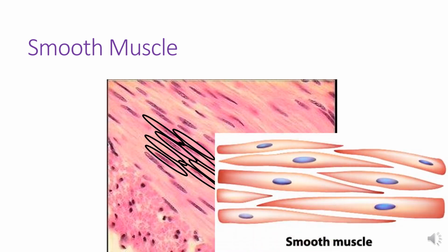One thing that you might find that's different is in some images of smooth muscle, the cells are kind of separated by a small white space that allows us to see that they're not all packed directly on top of each other the way epithelial tissues are. So please make sure you look at several examples of smooth muscle and epithelial tissues to try to find those differences. Coming up, we need to take a look at how we put this entire process of our decision tree together.